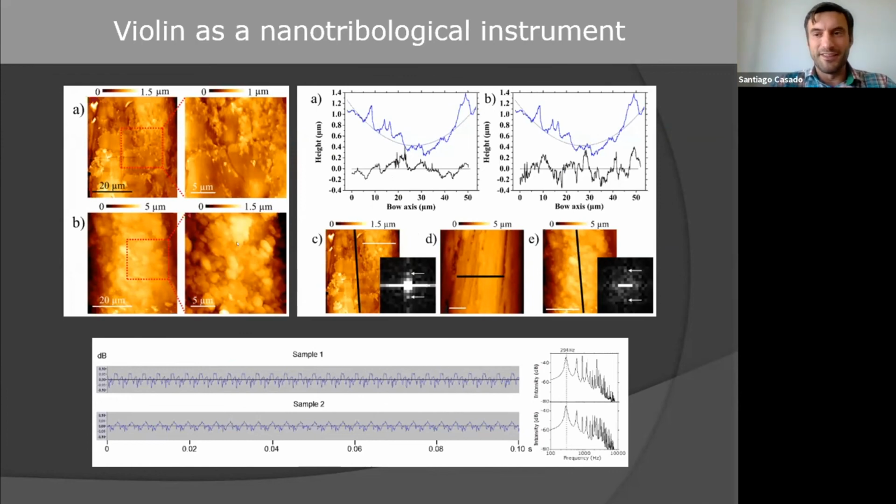this was very difficult because the tip gets stuck to the rosin. But finally, I got the images, and I discovered that the periodicity is the same. So by putting the rosin, we have basically the same thing. But you see that if you compare, there is much more rosin in the case of the bad bow hair. And how is that related to biology? I think it is very related, but we have plenty of things to discover here in the connection between nanotribology and biology, and hopefully I will continue with these experiments.